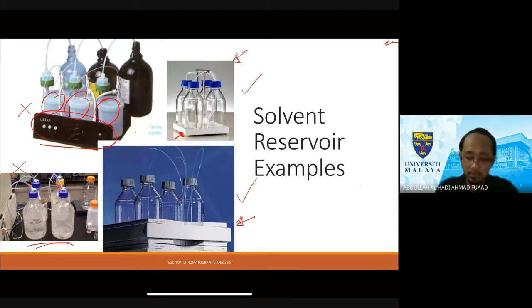So if you have a system like this, in case there's any solvent backflow, or you accidentally fill up the solvent until it's very full, and then towards the end of the day your system has the gas purge system, it will purge everything and you have solvent spillage.